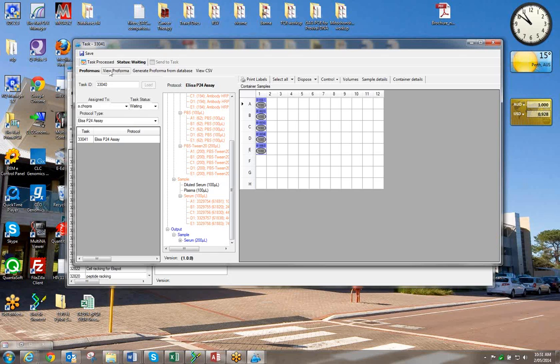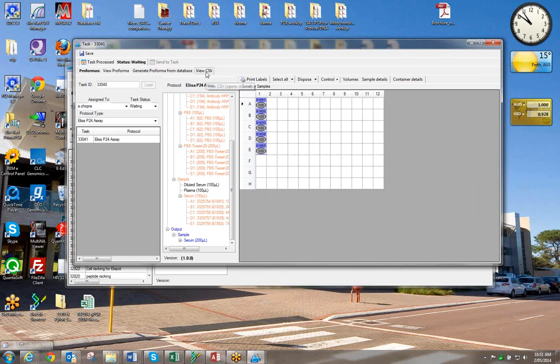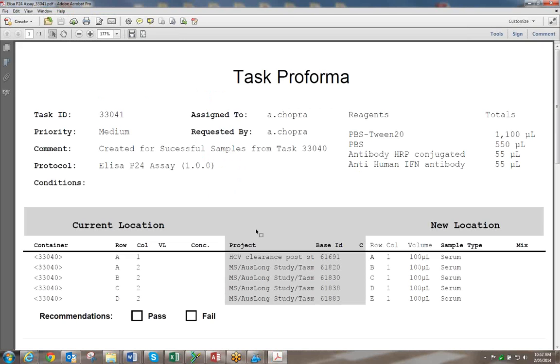Okay, so looks like it hasn't generated the CSV file for whatever reason. It doesn't like the format of the CSV file, so it hasn't generated it. But it's also possible that because they're on the dev, it's not generated, so we'll have to have a look. If it had generated the CSV file, the directory where it saved the CSV file would come up here. But obviously for some reason it hasn't generated the CSV file here.